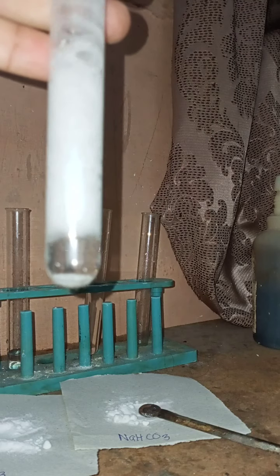And then we can do the same to the other test tube. This test tube contains the solution of sodium carbonate. Now we are going to add acid to this solution. Let us see what happens. This is the kind of reaction that takes place, and we can observe it well. Here you can see the effervescence of the carbon dioxide gas.